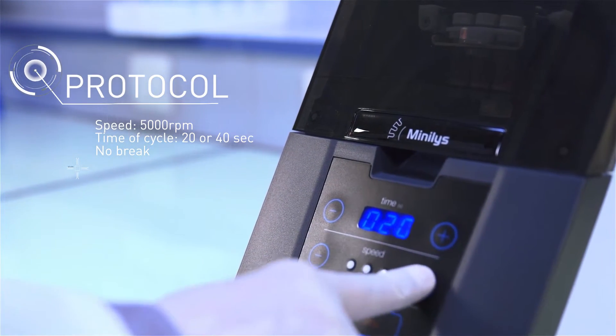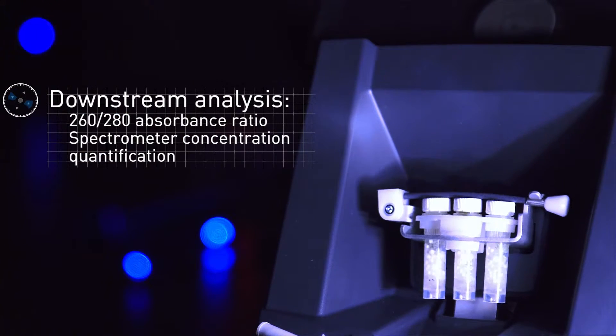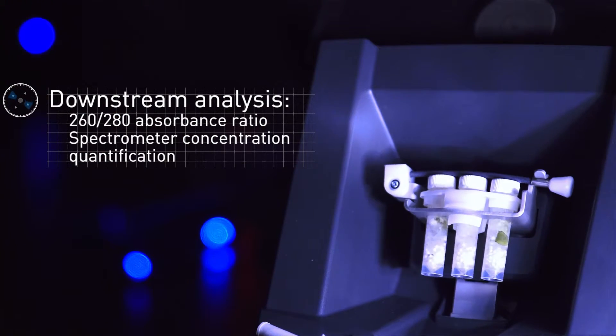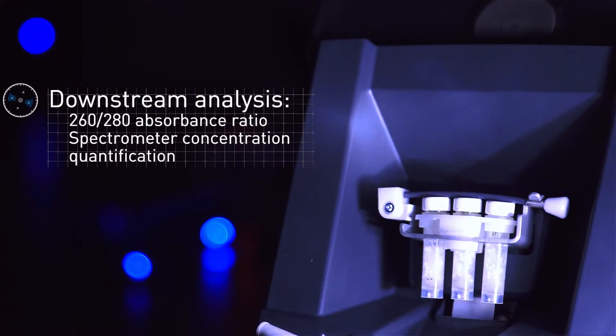After homogenization, RNA quality is evaluated by the 260/280 absorbance ratio and the concentration of RNA is measured.